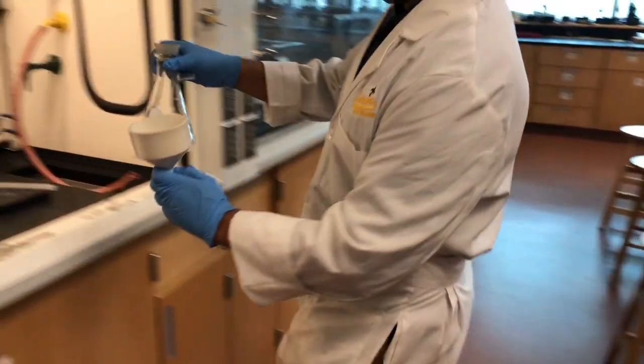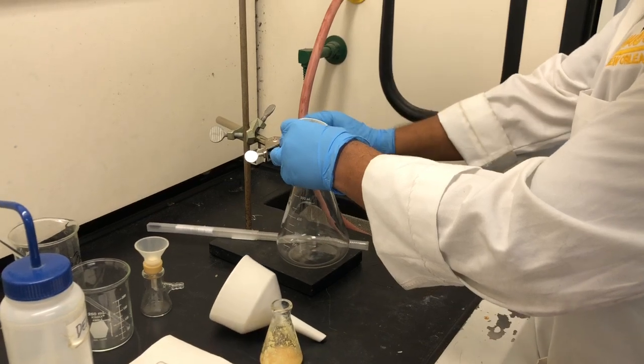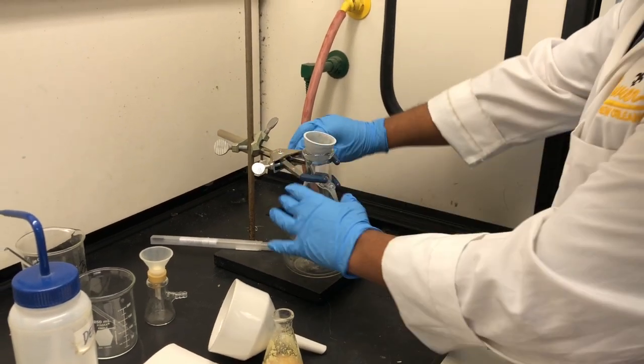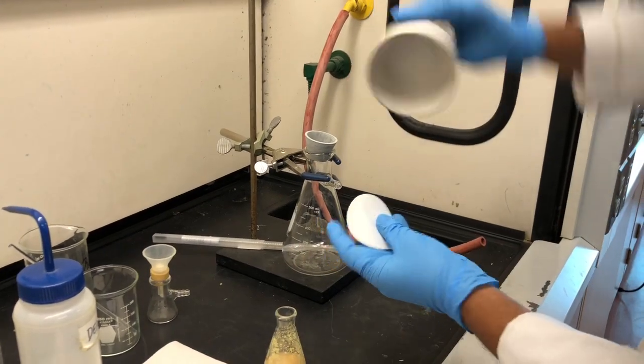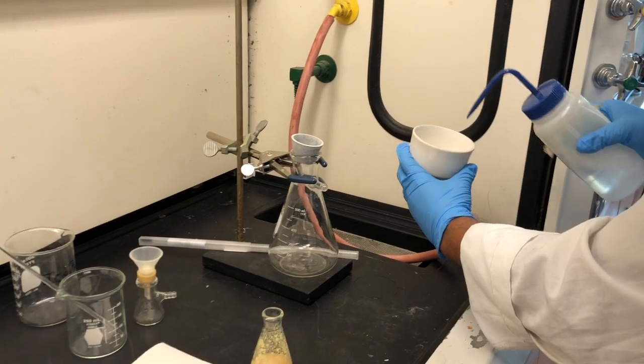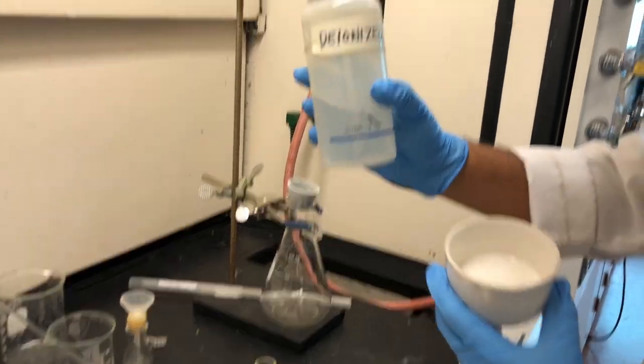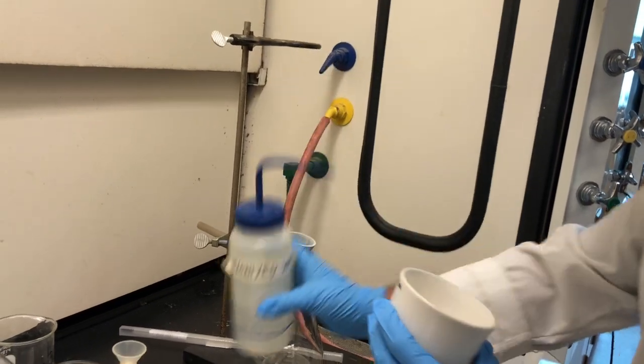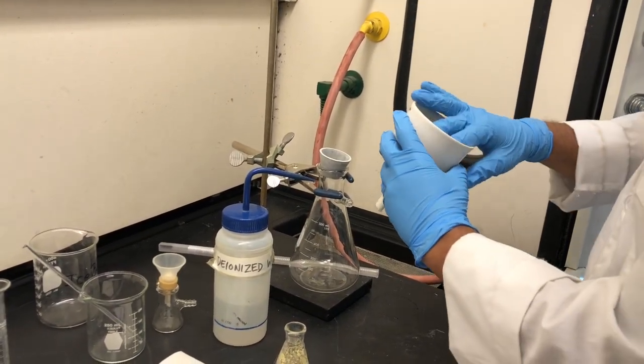Now it is expected from all of you that you understand and you have learned so far how to perform a filtration. However, I will still remind few basic concepts. First is you need to make sure you wet the filter paper. Otherwise, filter paper will not stick to the flask. You can use deionized water and you can see that the paper is not falling out.